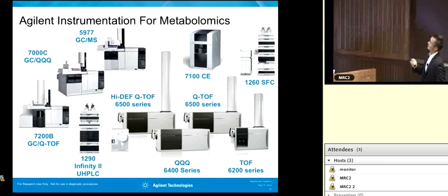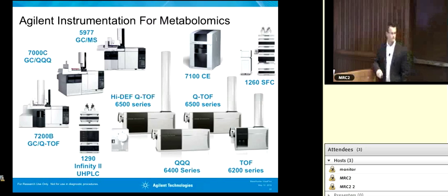What's nice is we put in glycolysis here, but we didn't put all the metabolites here. We want to know where it is, and we can expand out glycolysis and look at those metabolites if we were monitoring them, and then consolidate that back down for a cleaner pathway. So we've generated our pathway here and given some biological relevance to our data, right? And we've done this all in about a couple of hours.